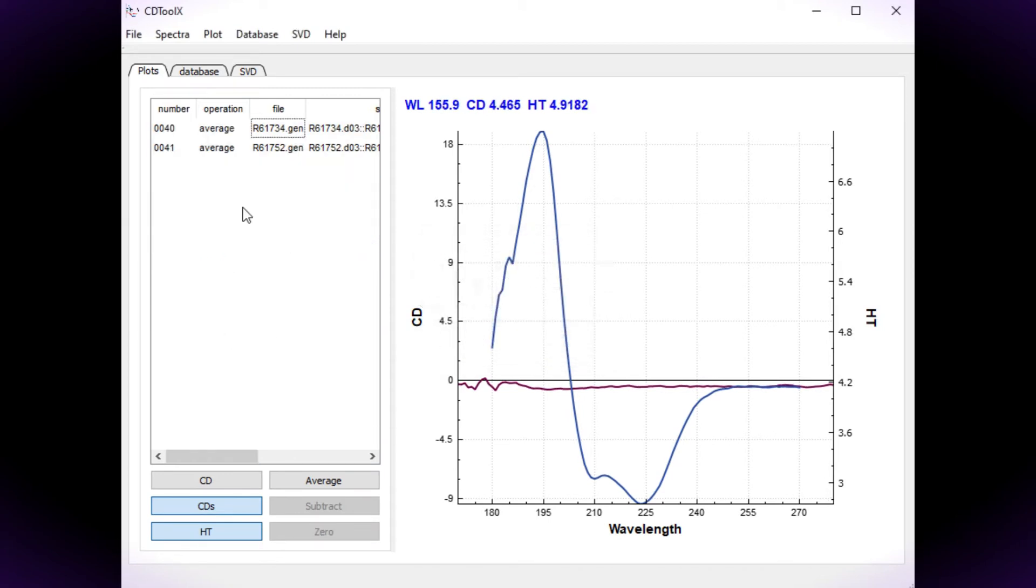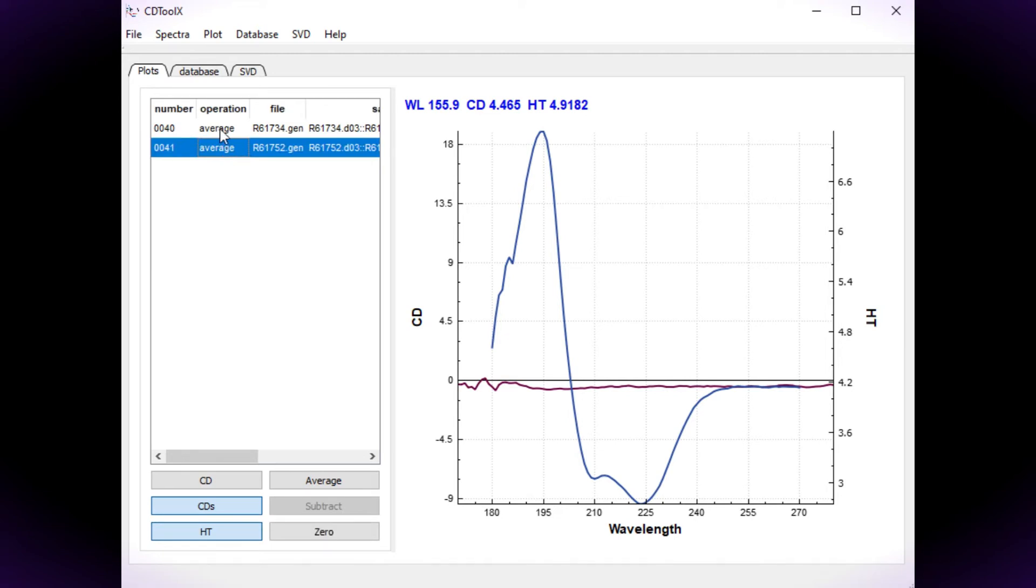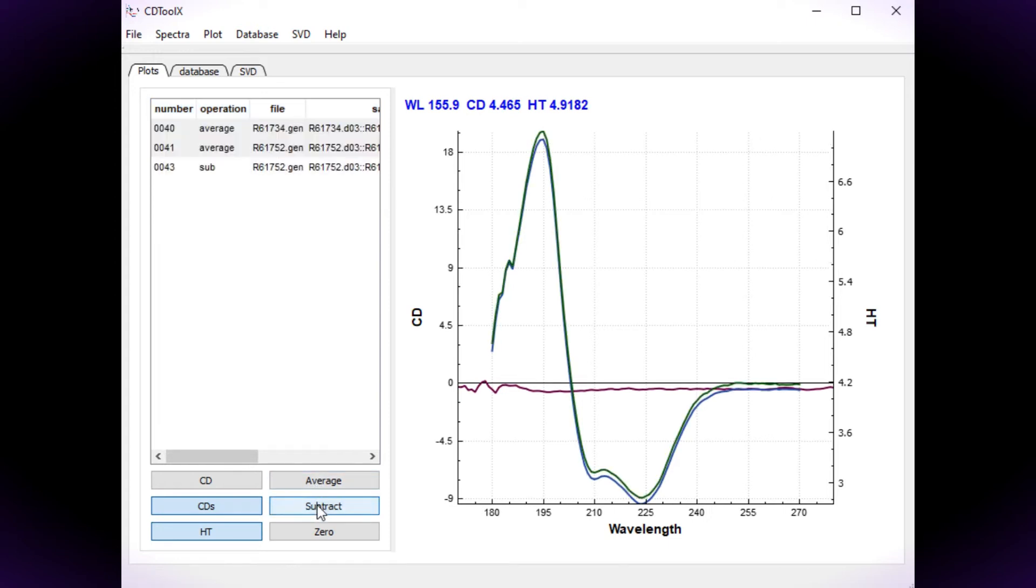Now subtract the baseline spectrum from the sample spectrum. Select the sample spectrum, then select the baseline and click subtract.